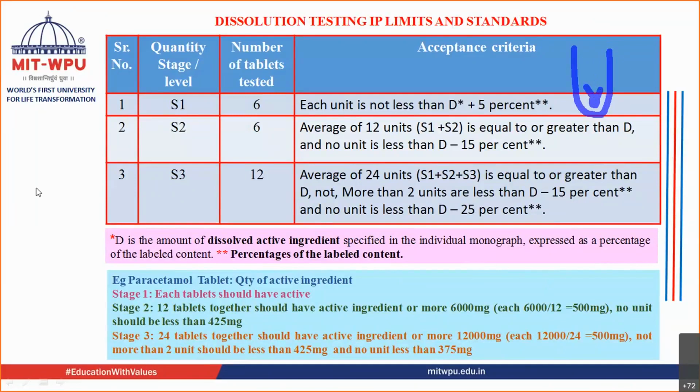Say after 10 minutes, now you remove the first sample. मैंने आपको बताया यहाँ पे सैम्पलिंग प्रोब है. So you remove the sample, you have a sampling hole over here in the lid. From this hole you remove some content of the sample, right? Let's just imagine that you have removed 5 ml of the sample from it.